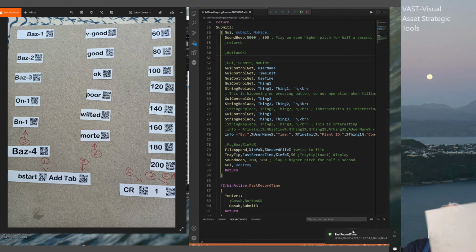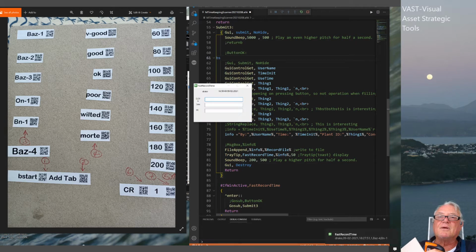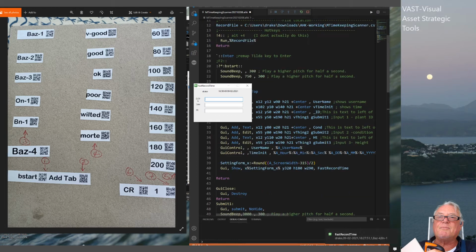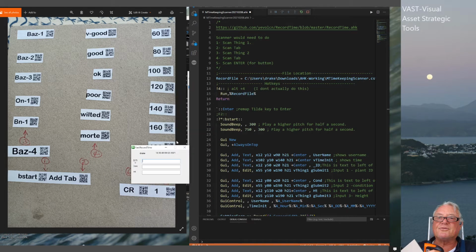So let's go back and see what we've actually activated. We're going to hit the start button there, and it's going to wake itself up. We're going to open up. Now the first thing you heard there was two beeps. What that's doing at the very beginning, if we move this across here, is that as soon as we triggered the program, we're making a couple of sounds.